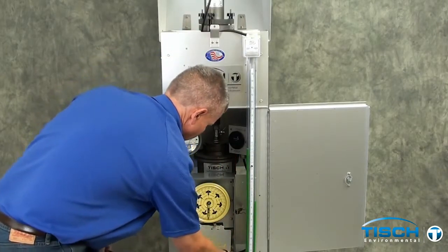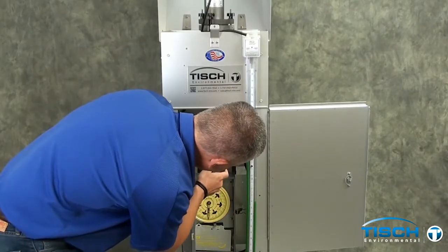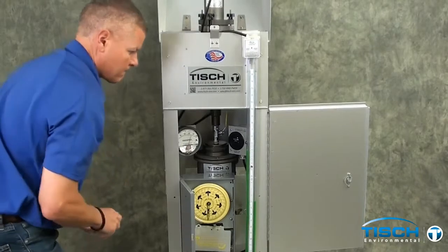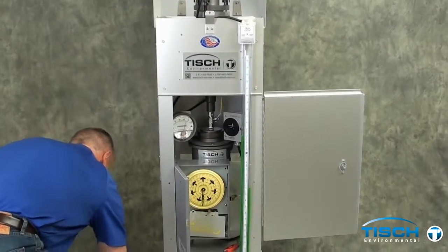With the magne-helic set at 70, you will now need to read the manometer — one side will go up and one side goes down, and you need to add those together. The first reading that went up was 4.1, and the second reading that went down was 4.0, giving us a total of 8.1 inches of water.